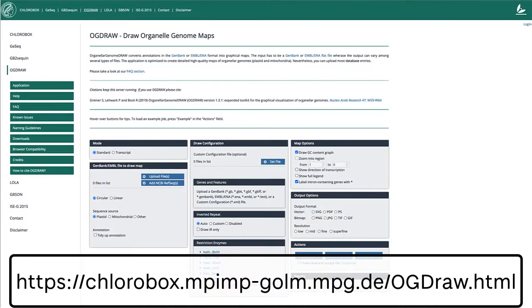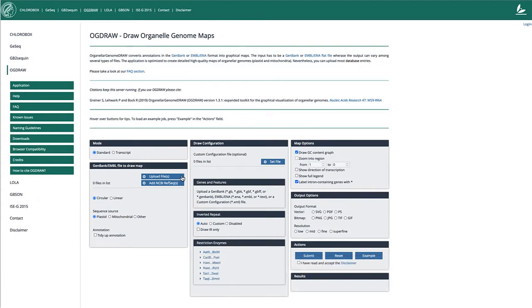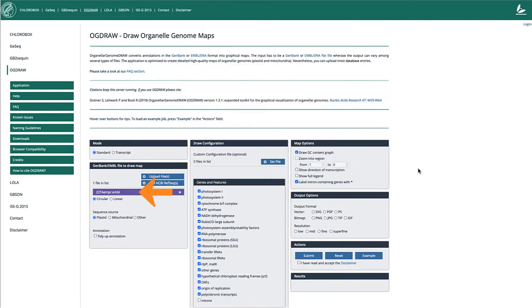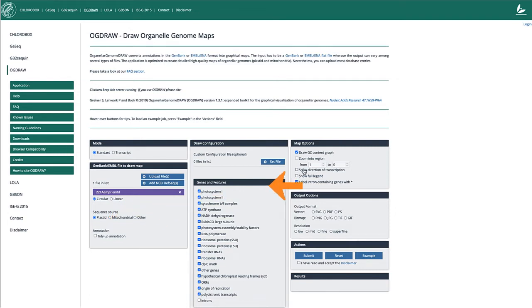I open the OGDRAW webpage using the link on the screen and upload the file. Circular and plastid options have already been selected. I tick the Show Direction of Transcription and Show Full Legend options.